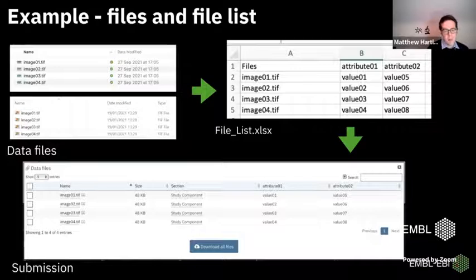Some are about what was the relevant gene, some are about what was the relevant organism or tissue or cell type or compound. So there's actually a lot of flexibility to describe the image data in different ways, and we need that flexibility because of the breadth of different types of imaging experiment. If you're unsure about what to include, it's probably a good idea to contact us, because we can make recommendations and show examples of where different subdomains of bioimaging have different standards.